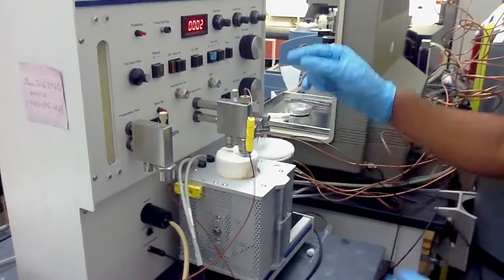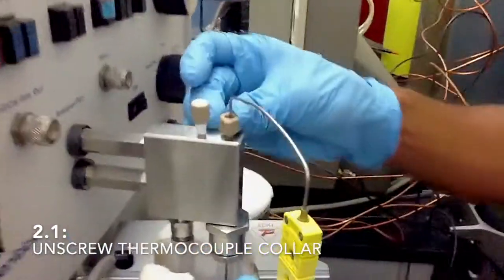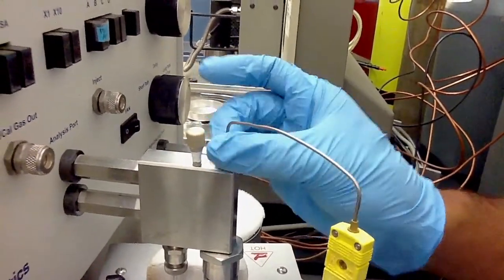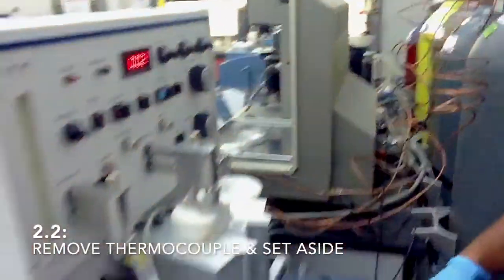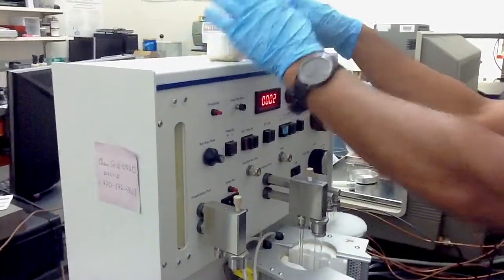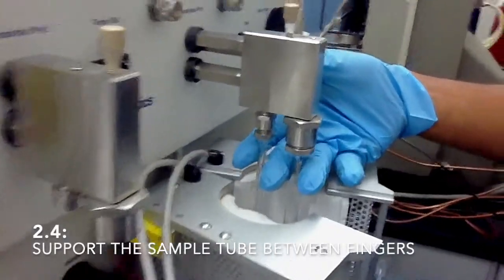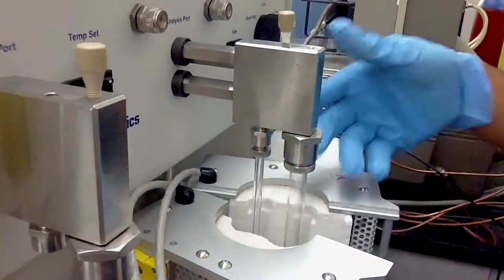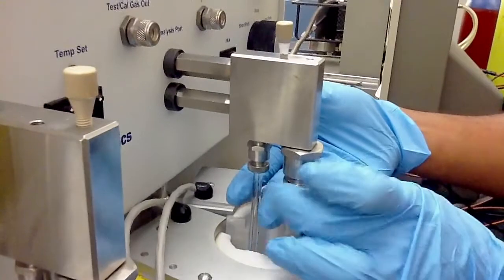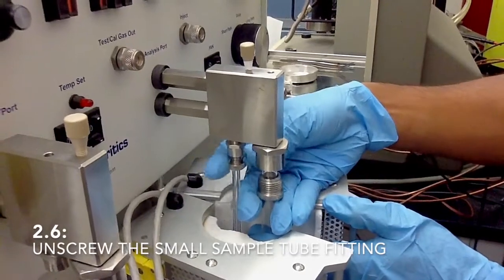To open the sample tube, first of all, we need to take out the thermocouple, which is here. We will unscrew this one. Finger tight is enough for this. Take it out. Now take this insulator from here. You can keep it anywhere, but I would like to keep it here. And then put your finger just between these two tubes. I'll explain why. Put your finger here, and use the other hand to take these two out.